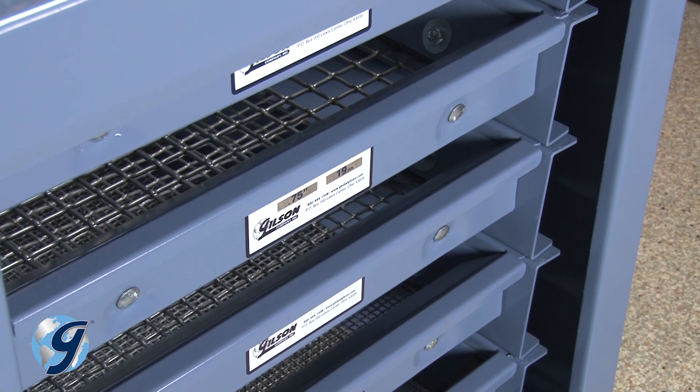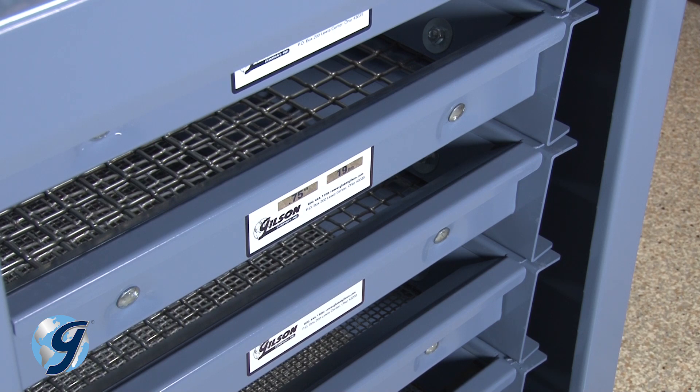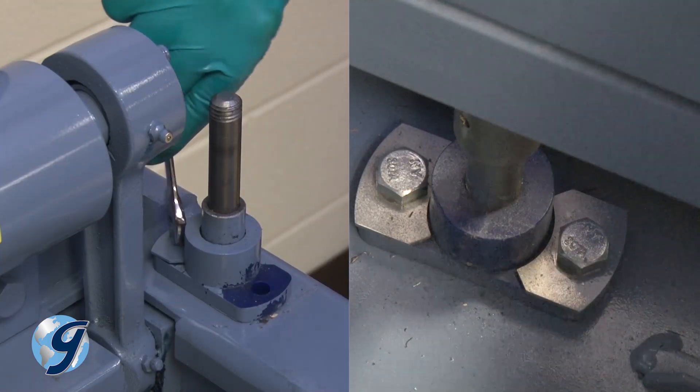If your machine appears to clamp the screen trays improperly, the unit's clamp rod assembly guide bearings may be worn.